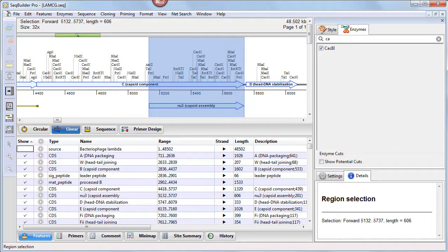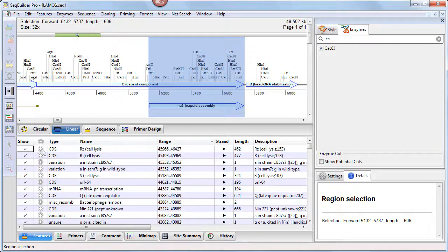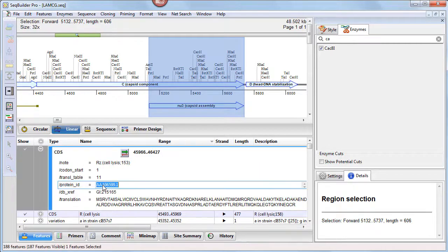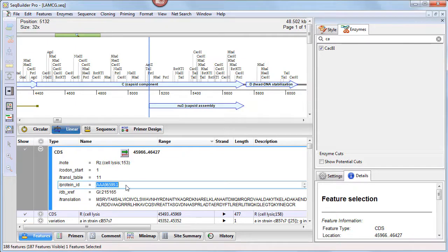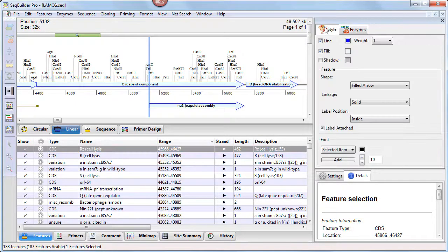Views that list features and primers, like the features view shown at the bottom of this window, can now be sorted, which easily lets you find and edit specific items. Individual rows can also be expanded, where you can then edit the information, or collapse to show more rows.